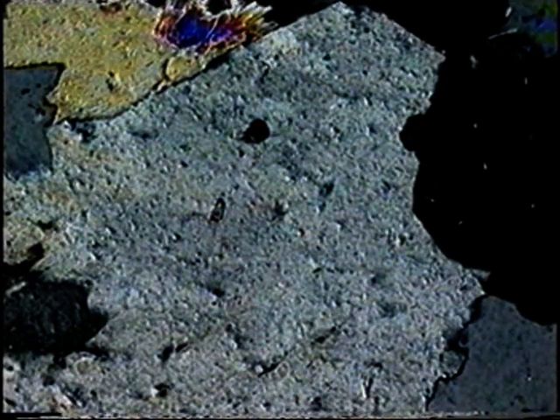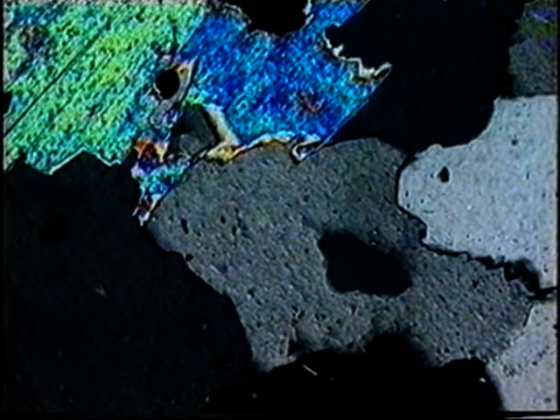Here's a muscovite flake cut normal to 001. But cut parallel to 001 it appears quite different with low birefringence. And here are both orientations side by side.